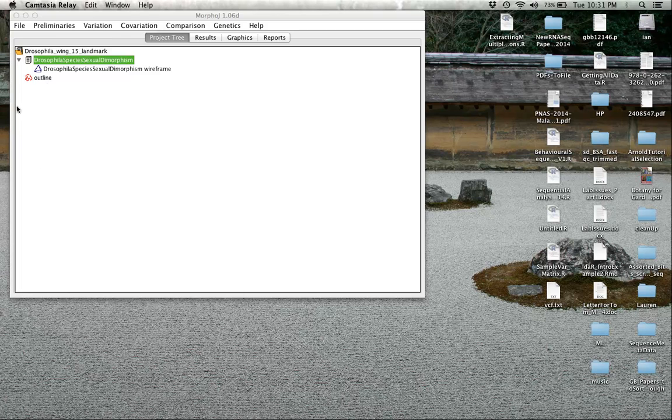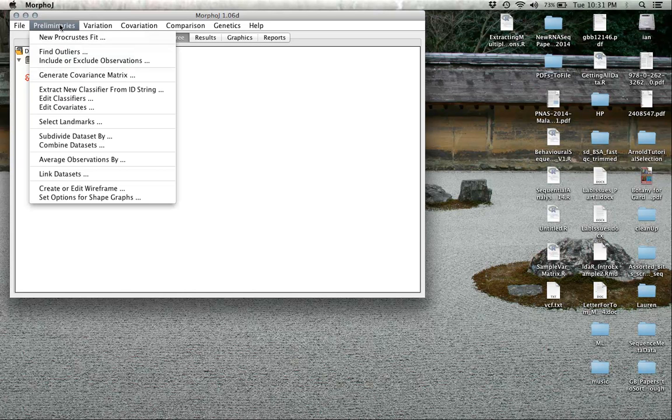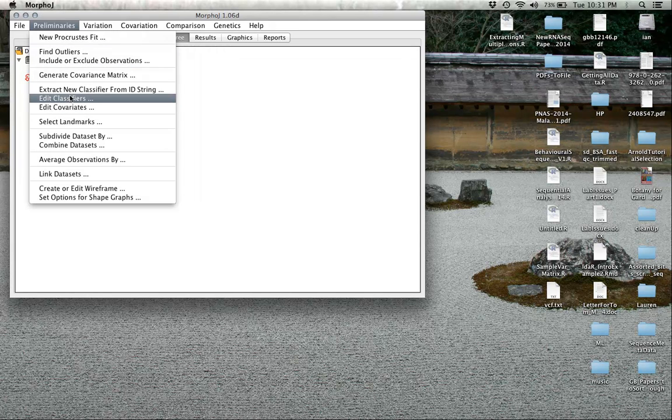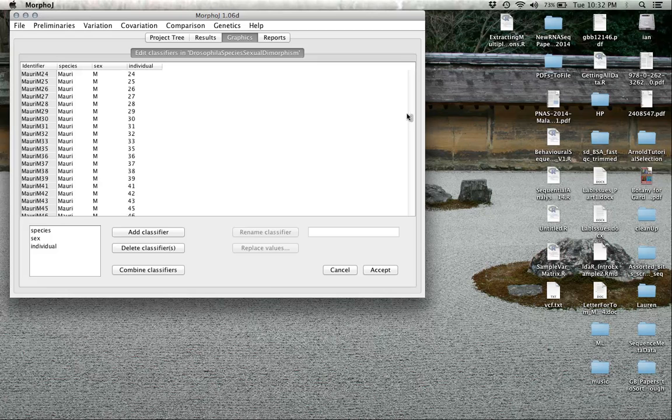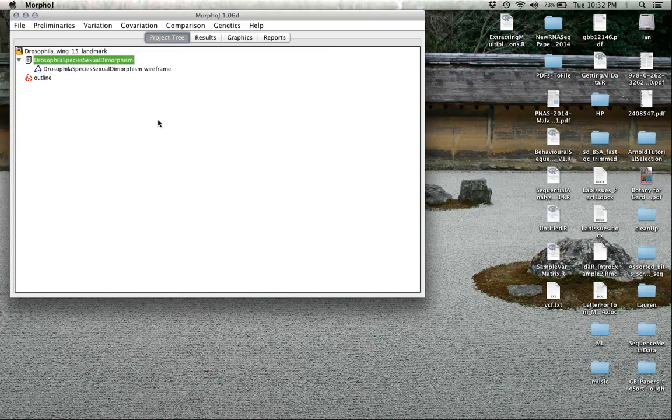We're going to make sure that the data frame itself, the Drosophila species sexual dimorphism data set, is highlighted. And we've already generated our classifiers from the first tutorial, so we don't need to do anything else there.